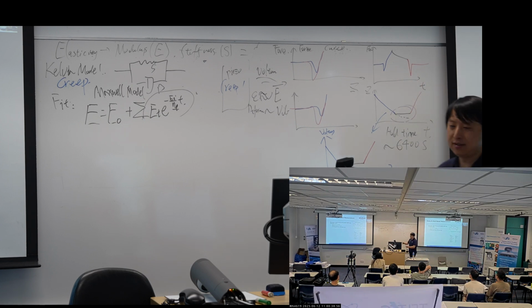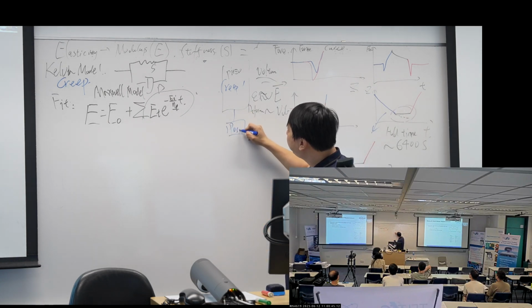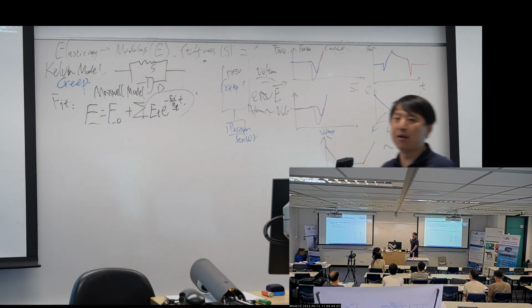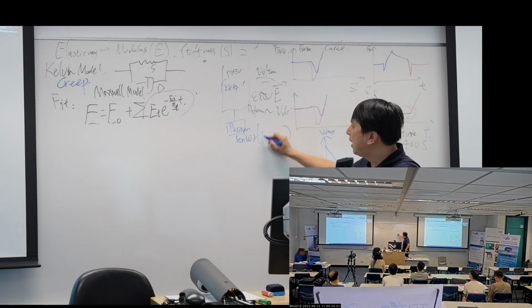As such, to change this, there is another setup in our instrument. They have a position sensor. And the name of this position sensor in the dimension system, they call it height sensor.